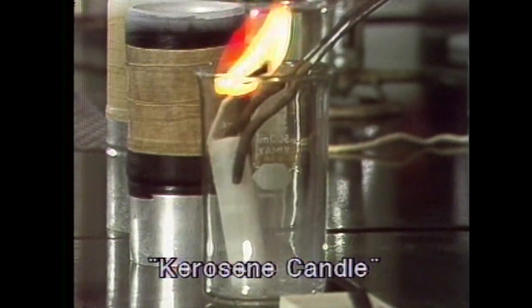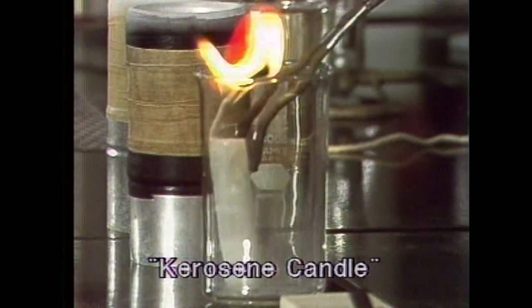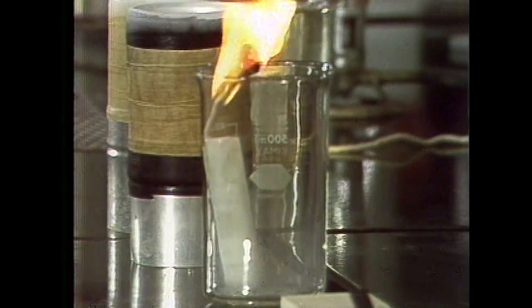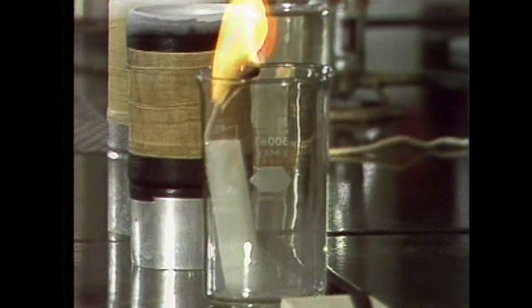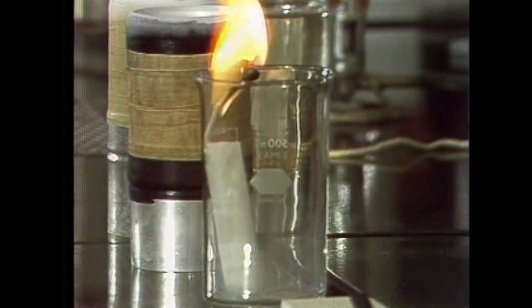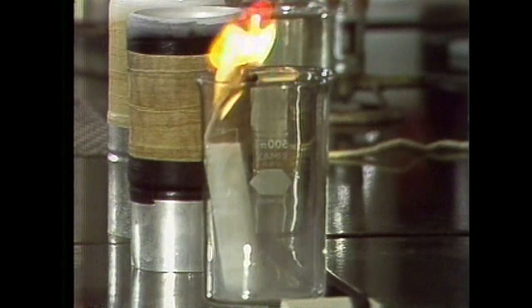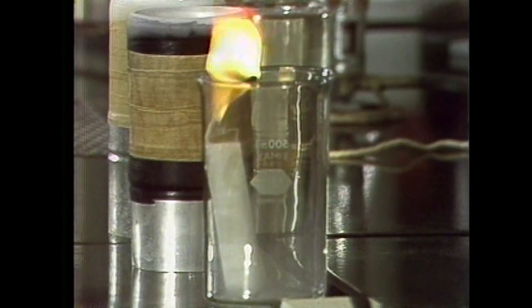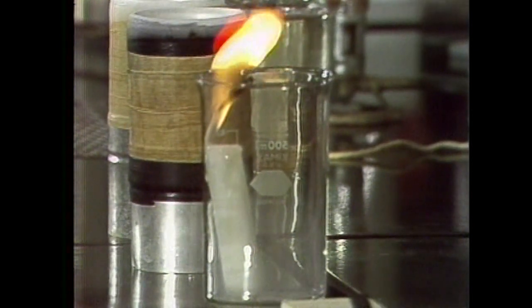Of course, the kerosene is going to melt, as you can see here. And if one were living in a liquid nitrogen world, then we would use this kind of candle to supply us with light. And as you can imagine, if I let this go a little longer, the kerosene is going to melt, and the whole thing is going to catch on fire, so I'm just going to blow it out now.